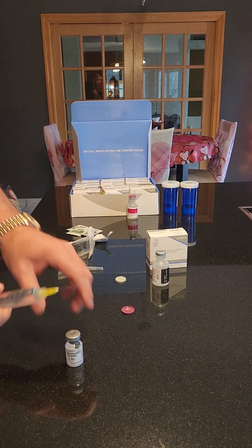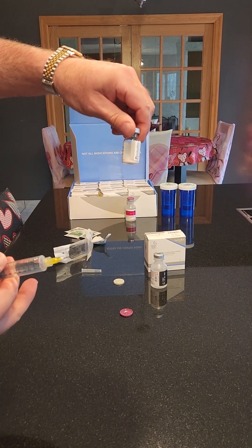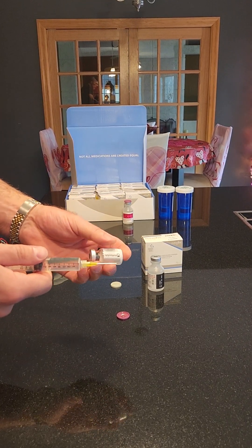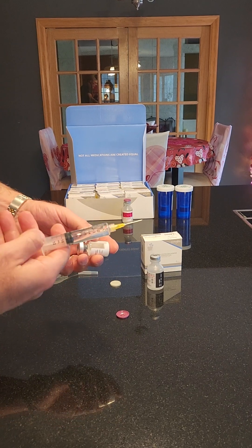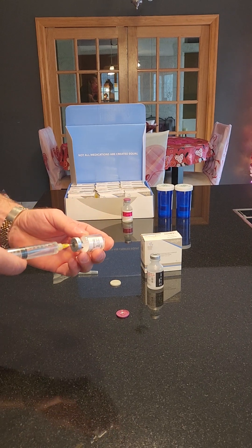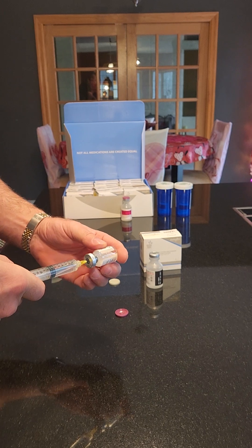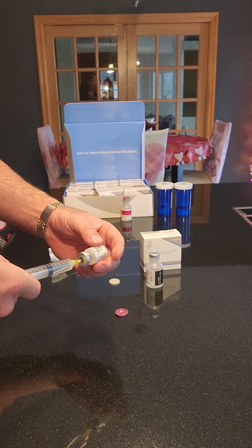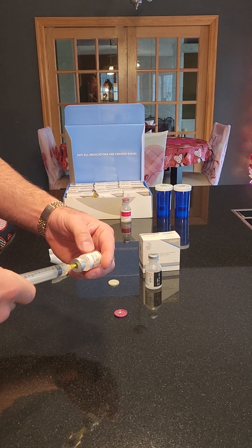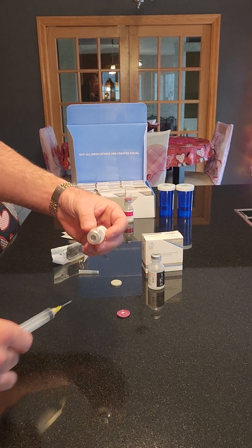Now take the vial of powder — whichever peptide this might be or whatever you're mixing. Be careful when you inject this: these are vacuum sealed so sometimes they will suck the water in pretty fast. Make sure you hold on to it a little bit, inject it in there, and kind of guide it — because if you let it go it'll shoot it all in. Just kind of gently turn the vial, and be sure to hold on to the plunger and the syringe. Then pull that out.